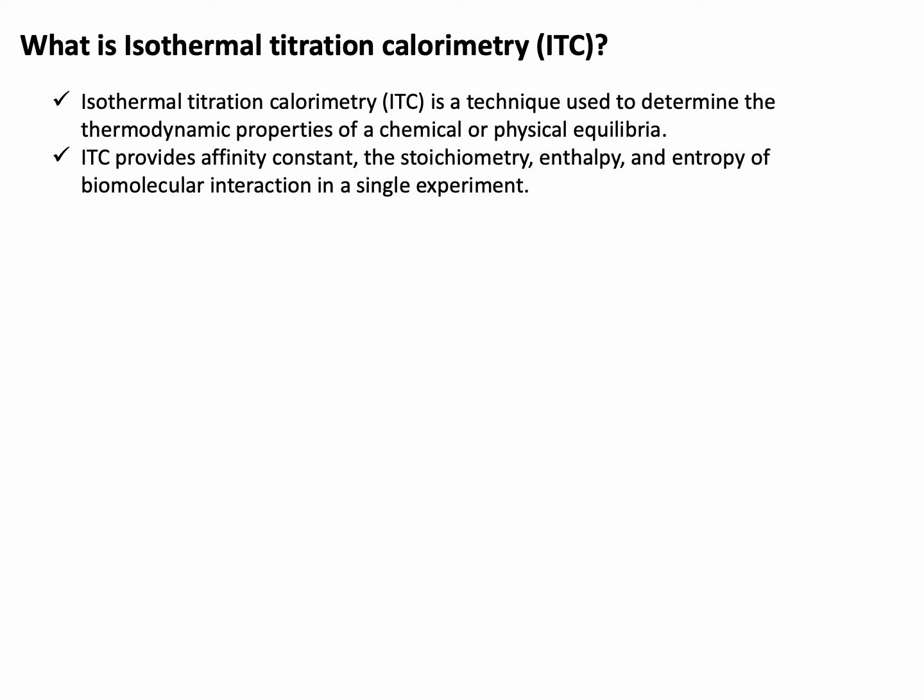Simply to say, ITC is a technique used to determine the thermodynamic properties of chemical or physical equilibria. ITC could provide the affinity constant, the stoichiometry, enthalpy, and entropy of biomolecular interaction in a single experiment.